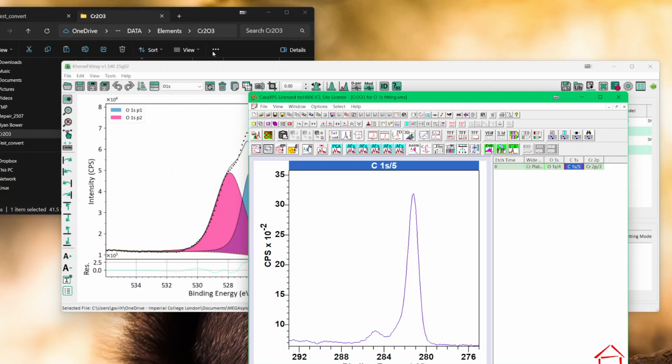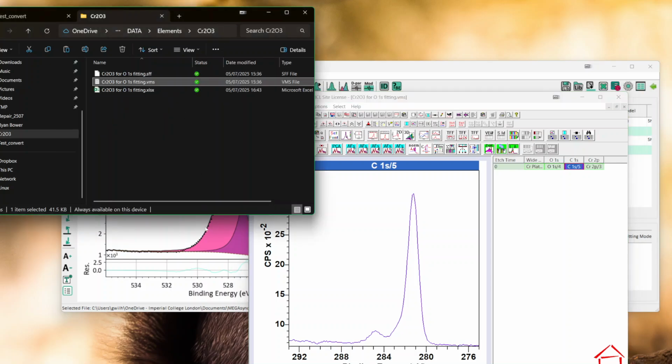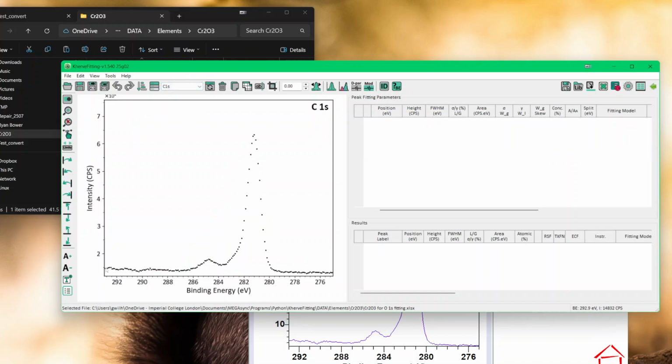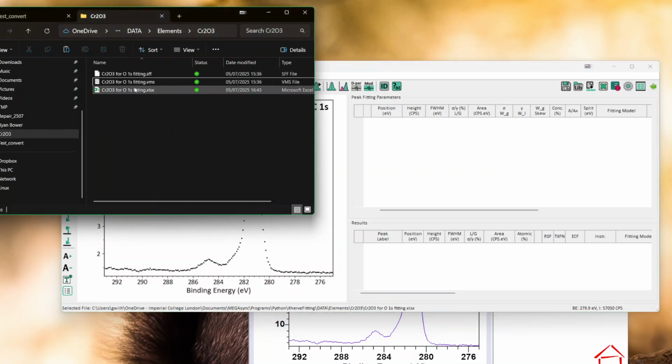And if I now go to Carbon 1S in the data file for Excel, you're not going to find 757. It's shown here, but it's 14,000. So you have to go into the Excel to understand what was done.